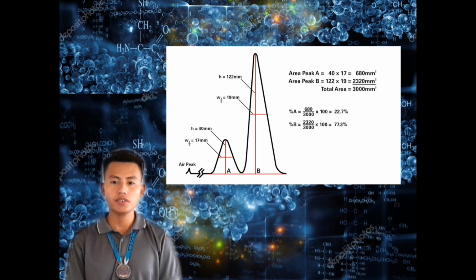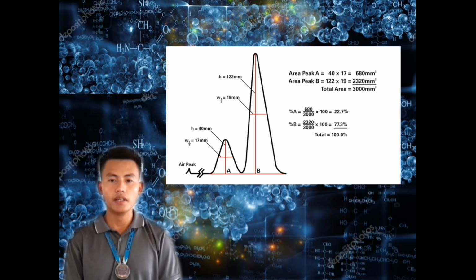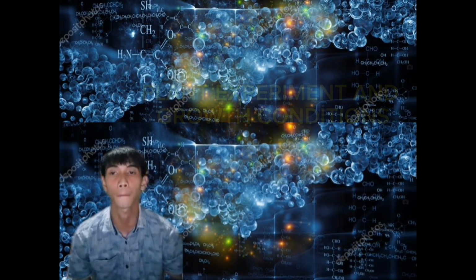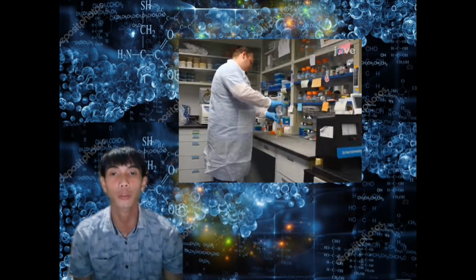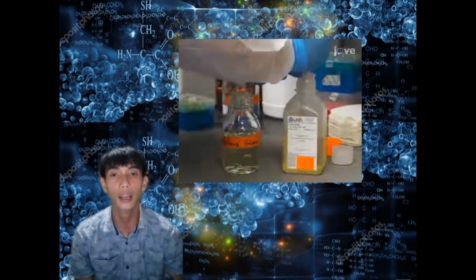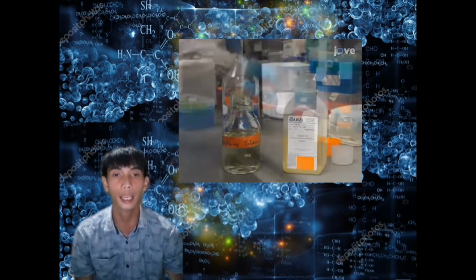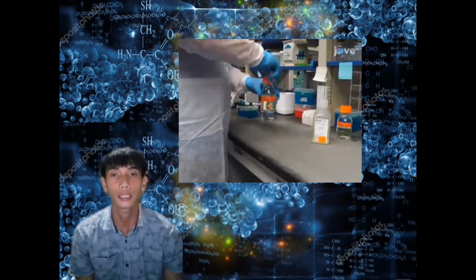The operating conditions were 250 degrees Celsius, carrier gas, and oven temperature. Plant experiment and growth condition. The study evaluated the growth modulation of 2-nonanone and 2-tridecanone released from SLNs in L.